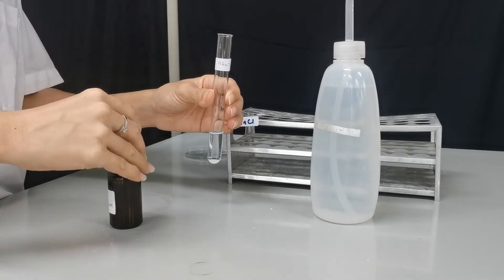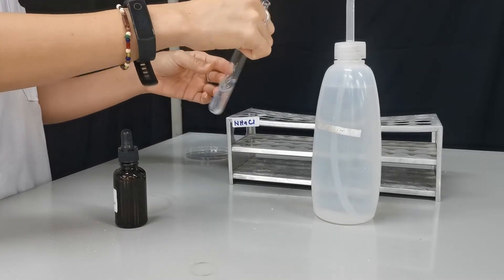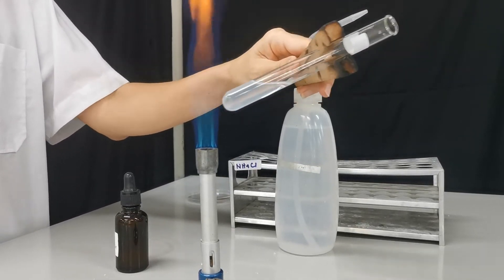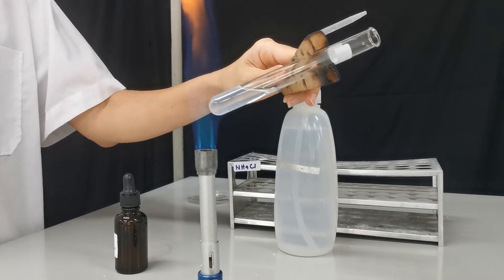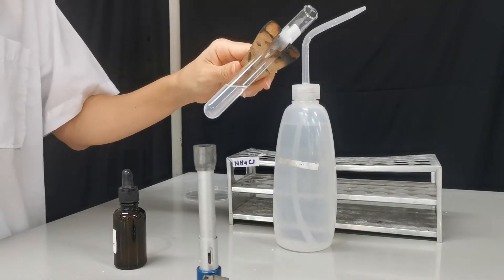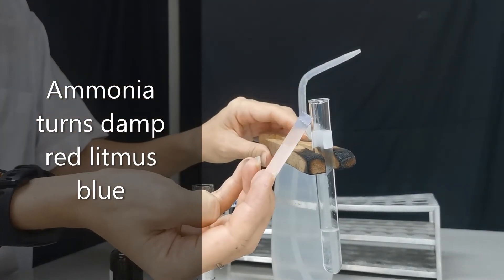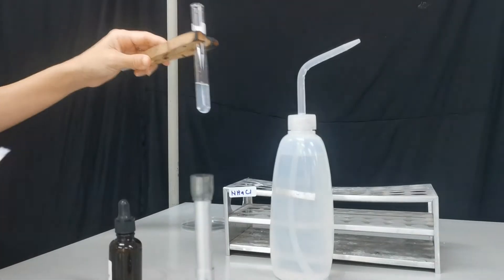We're going to heat up this mixture — just warm it gently. You can see the bubbles produced. We put a damp red litmus paper at the mouth of the test tube to check the gas, and we can see that the red litmus actually turns blue, so the gas must be alkaline, and that gas is ammonia.